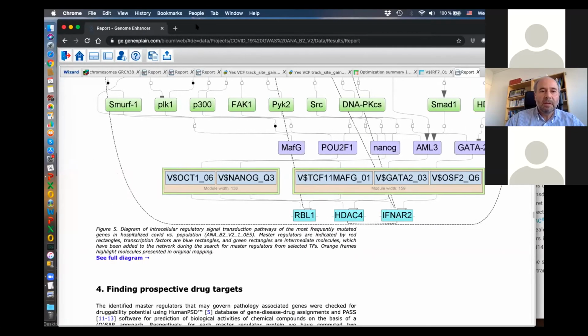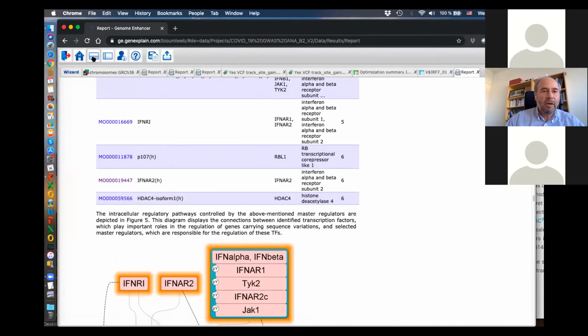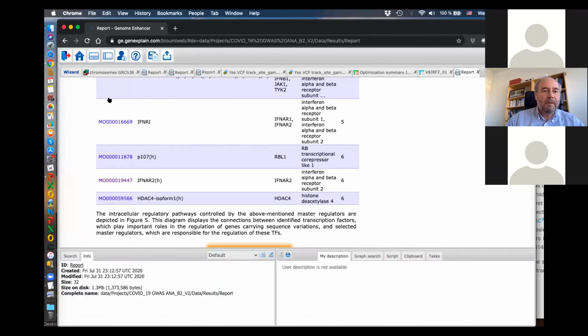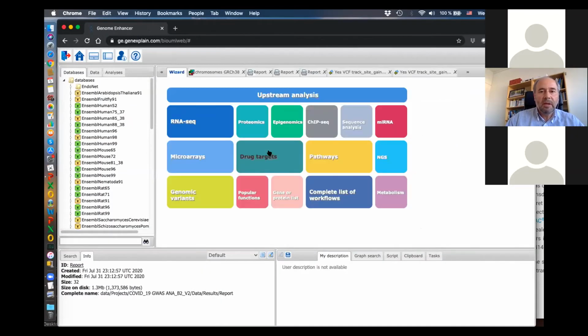You can see what now we can work here, how we can work here. Basically, with this platform view, we get more functions. So we get actually a lot of functions to analyze the data in detail. We actually can also look at the results of this pipeline of the analysis, and look at more details of those results.